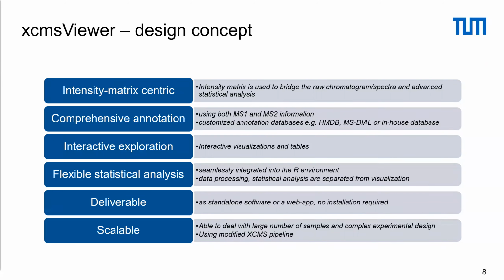A decision can only be made when we evaluate all this information. So doing this manually, I think, is a pain. But interactive visualization gives you a way: with just one click, you can see all the information.